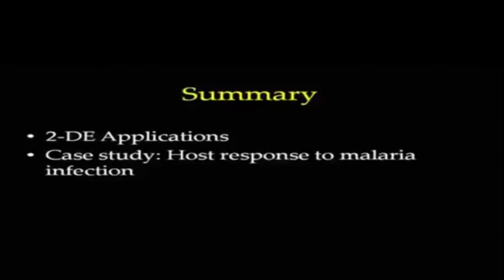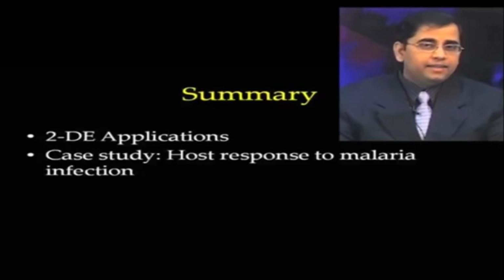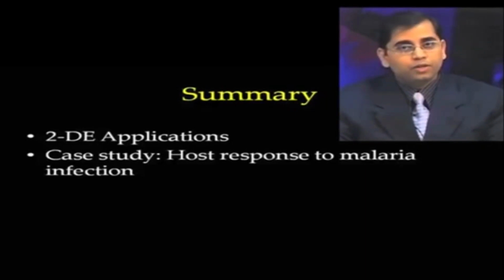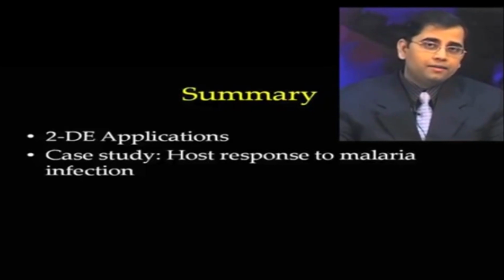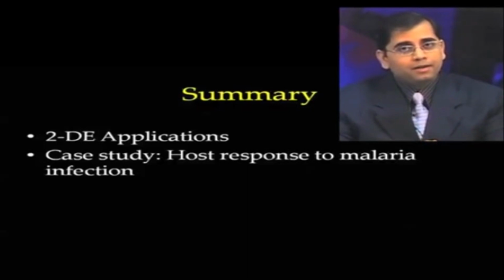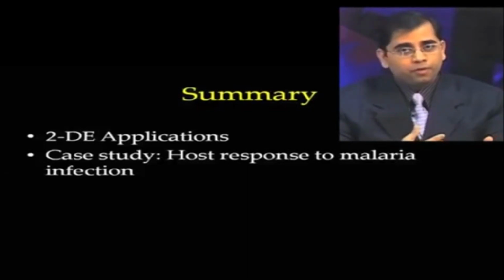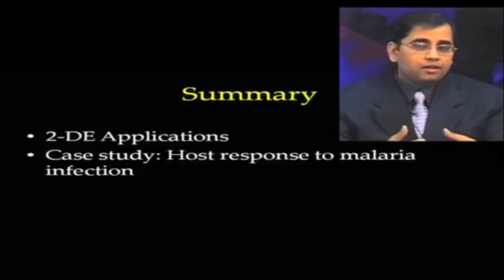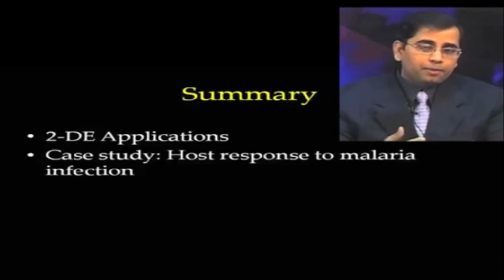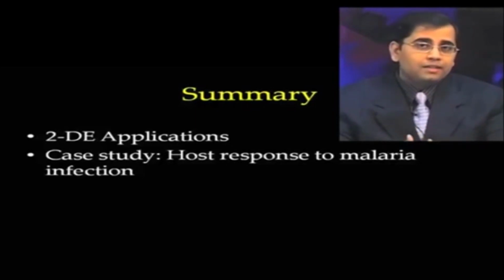So, we discussed how the two-dimensional electrophoresis technique can be applied for various biological applications. By giving you a case study and details of various types of experiments one needs to perform, probably you got an idea that before performing the final experiment on your cases and controls, a lot of optimization has to be performed, starting from your sample processing and how you can expand the coverage of the proteome. These types of quality control checks are very essential.